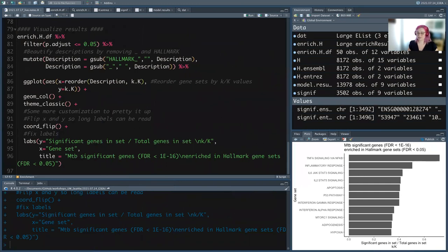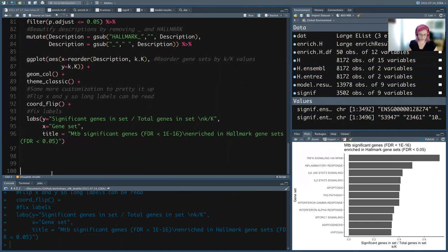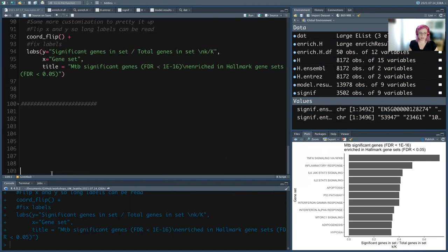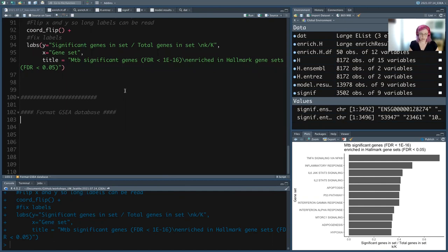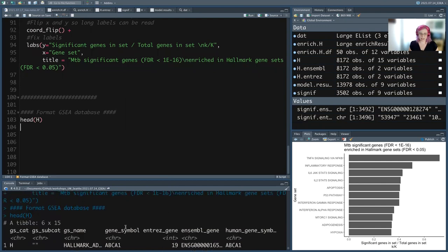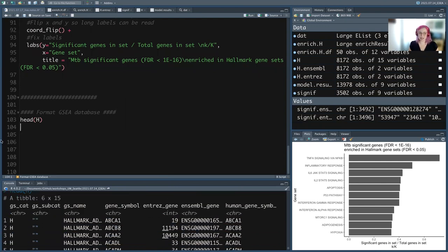So now we're going to run GSEA. Line break. GSEA uses the same gene sets, but fgsea — the package we're going to use — does not have the same formatting as clusterProfiler, unfortunately. The databases you download directly from Broad are already in the fgsea format, which is nice. But for consistency, I'm going to take our H database data frame and force it into the format we need for GSEA. If you went to Broad and downloaded it directly, it would already be in this format.